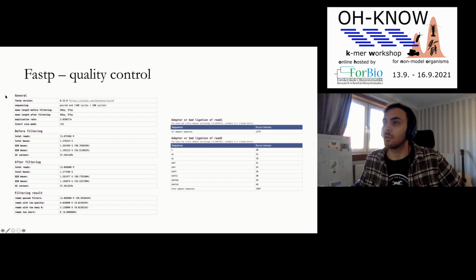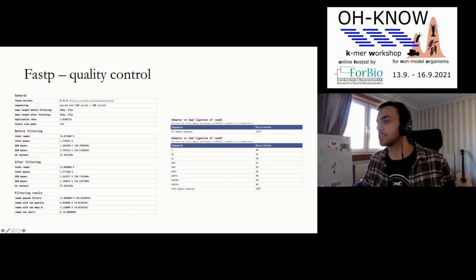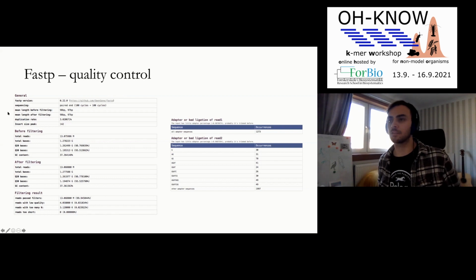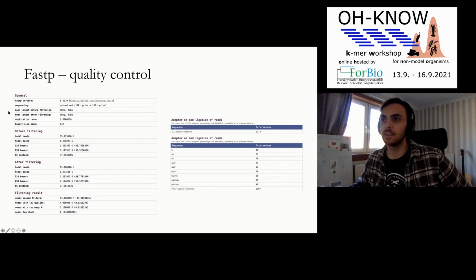When you give fastp a forward and reverse file of sequencing data, it will tell you everything you need to know about it. It will give you far more information than you'll probably ever use, but I think it can be particularly useful if you start to notice strange patterns in your sequencing data, which, if you work with sequencing data for long enough, will happen. And for that reason, I think it's a bit better than FastQC, which sometimes highlights patterns that aren't real and sometimes misses things which are.